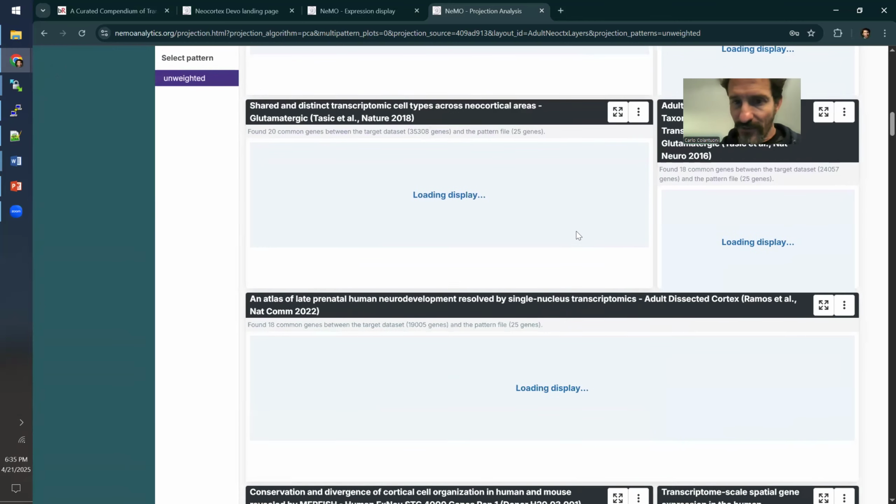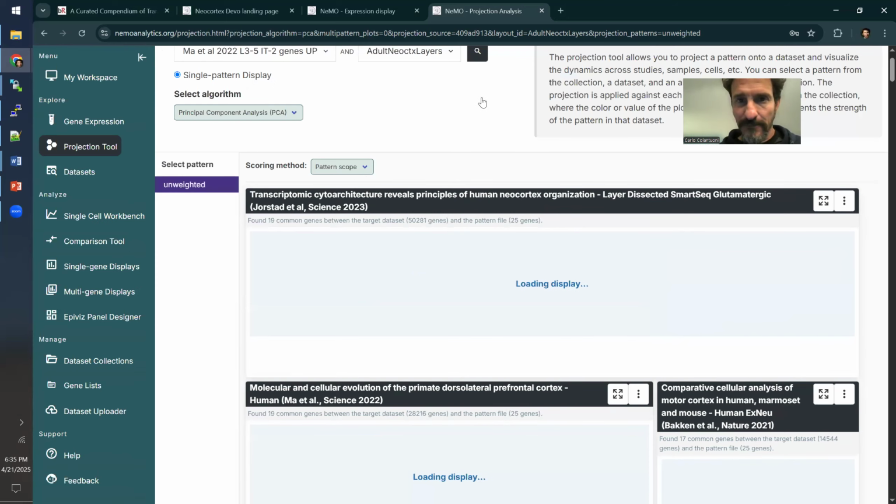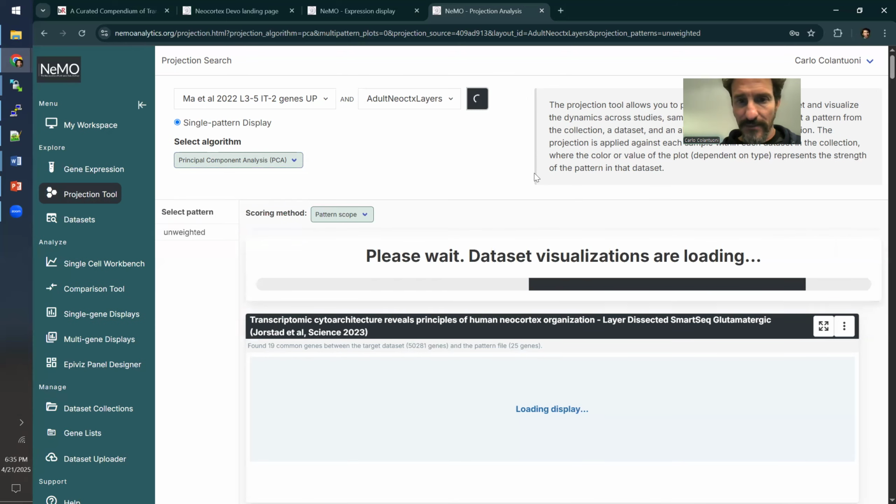Okay, still waiting for these to be displayed. I think they're created now.